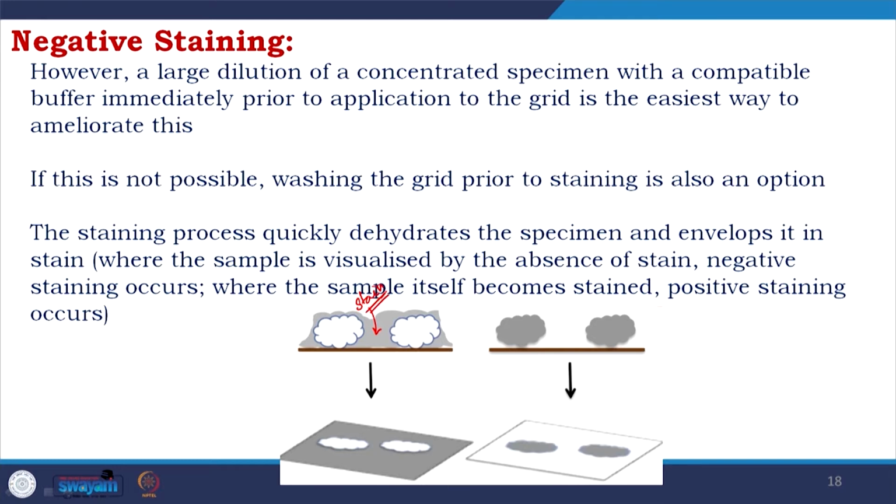So, the whole thing is stained and not the sample. So, the sample is unstained: negative staining.